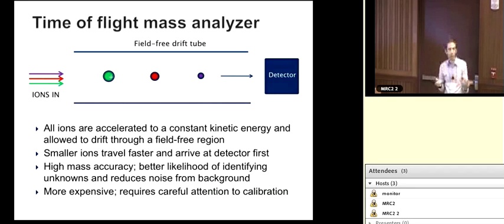Again, most of you probably won't need to pick one of these or another. The core lab will develop an assay, or run an assay that we know works for your samples, but it's useful to know at least the terminology. So we'll start with the quadrupole.